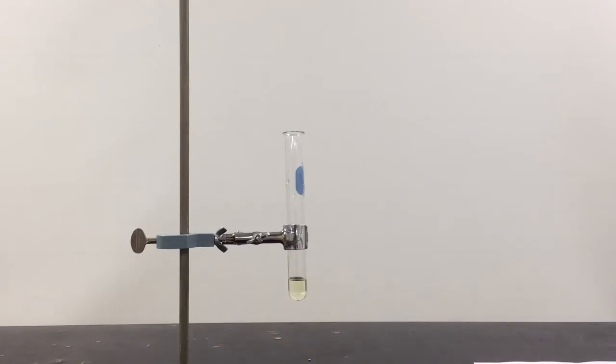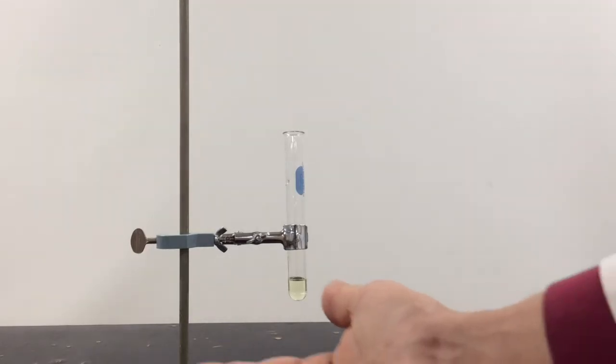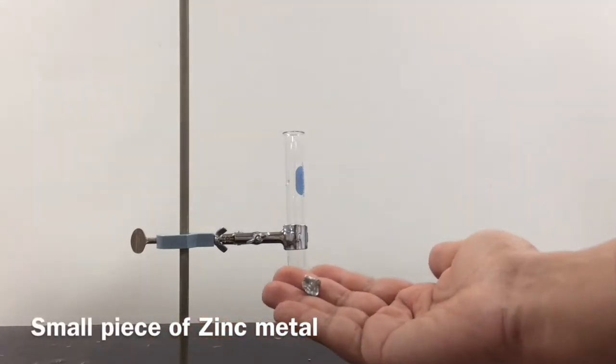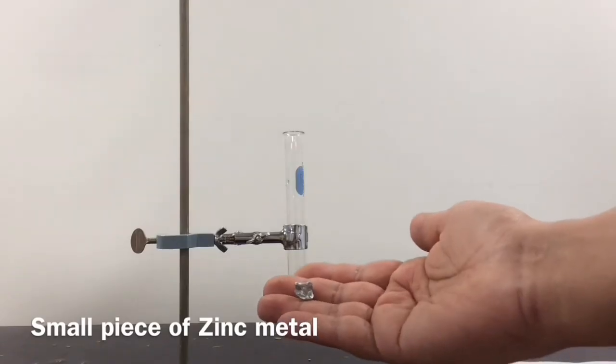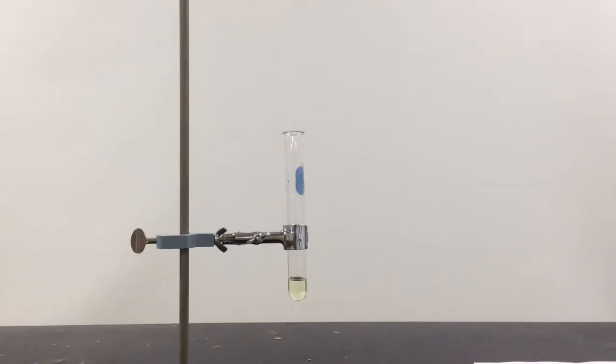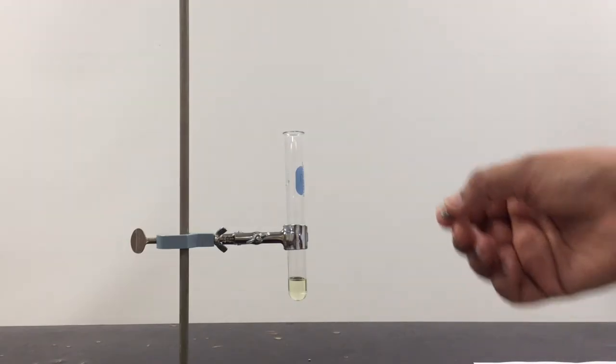Then, I'm going to take a little piece of zinc metal. I have this zinc metal in my hand here, as you can see. It's pretty shiny, just like most metals are, kind of silvery in color. And I'm going to drop the zinc into the acid.